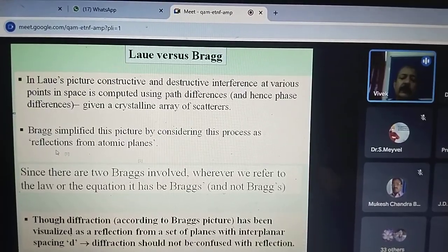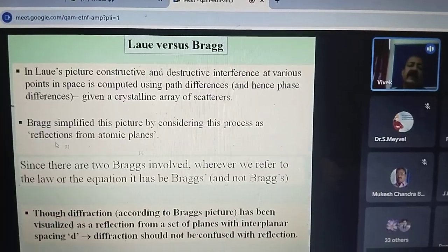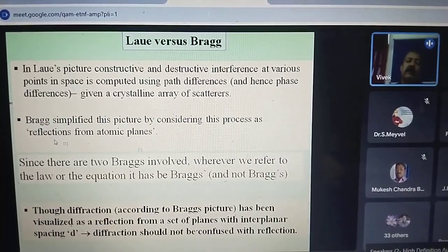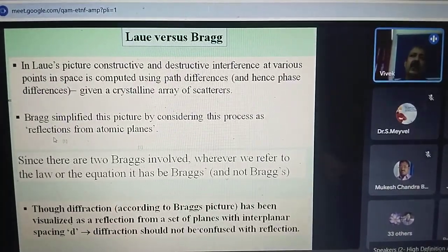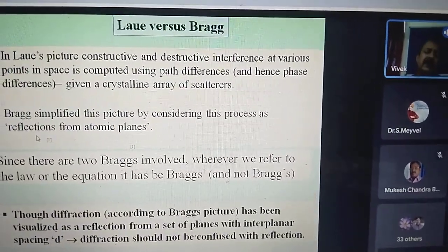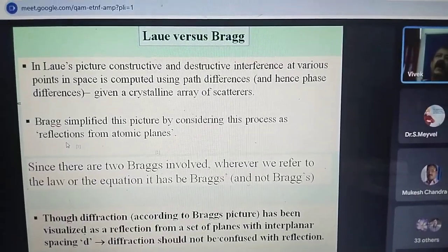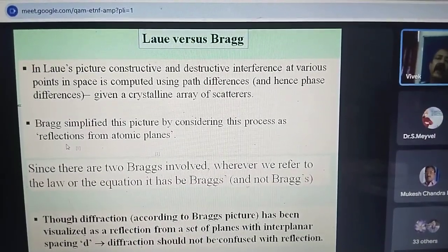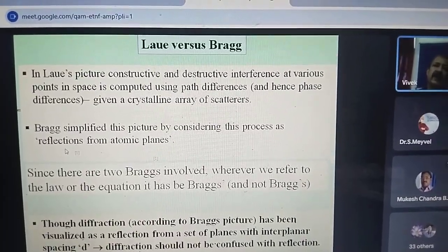Now you restrict yourself only to the triclinic system, because once you have calculated A, B, C, alpha, beta, gamma, you have made out that your crystal system is triclinic. So now I will leave the other 6 crystal systems. My work is drastically reduced. Now in the triclinic crystal system, I have only 2 space groups, P1 and P1 bar. P1 bar has an inversion center.